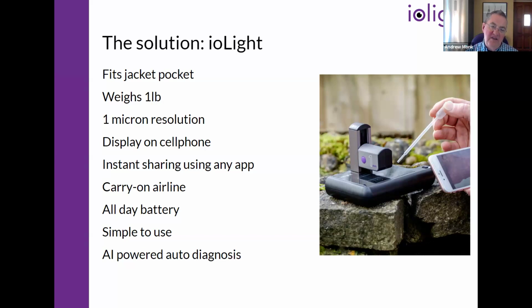Best of all, these are simple to use, and that means we can get kids involved in environmental things, and that's just so important to get kids to learn not to break the world the way that my generation has broken the world. And many of our citizen science projects have 3 generations of people in a family working on them. There's one group in particular in Wisconsin where the granddad and the granddaughter go out looking for cyanobacteria, and it's so great to see those multi-generational things.